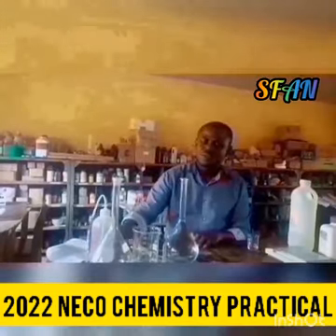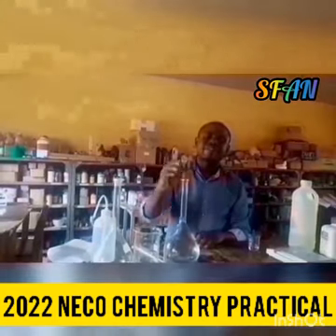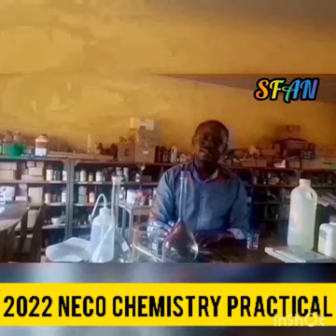So this is 1 dm³. So here I have 9.5 cm³ of my trioxonitrate(V) acid in 1 dm³.